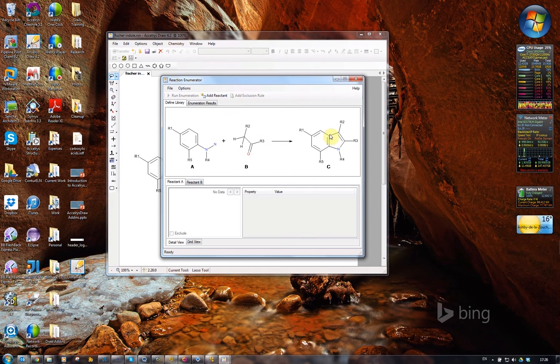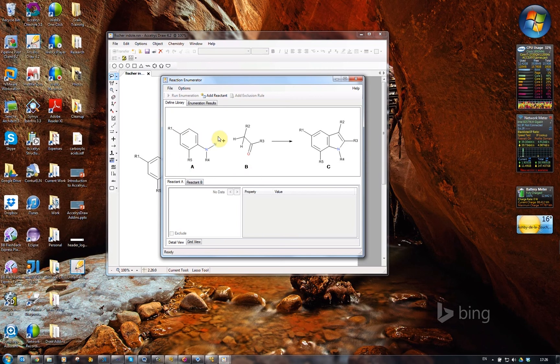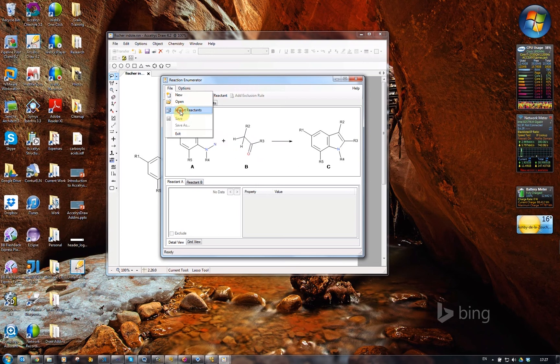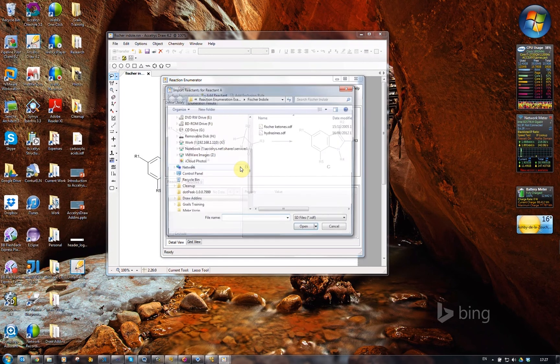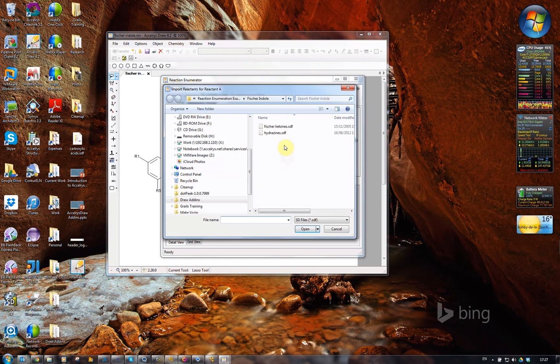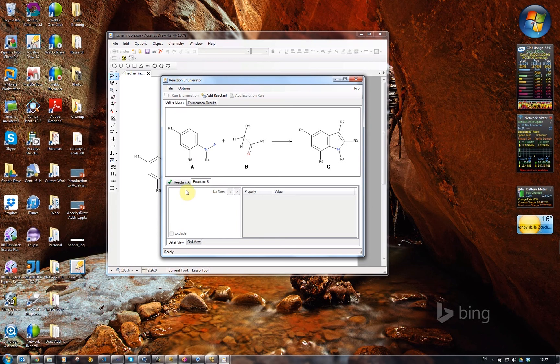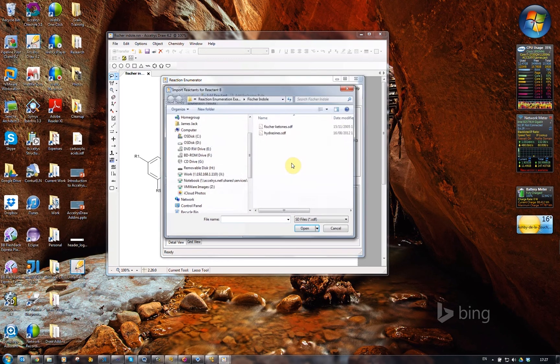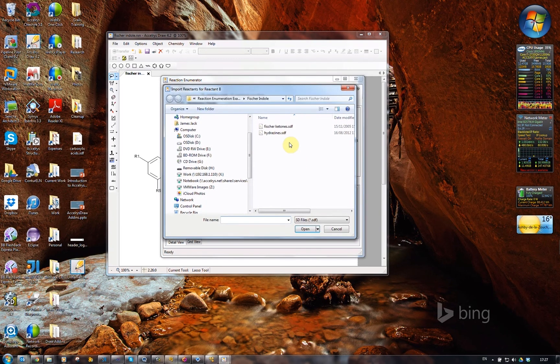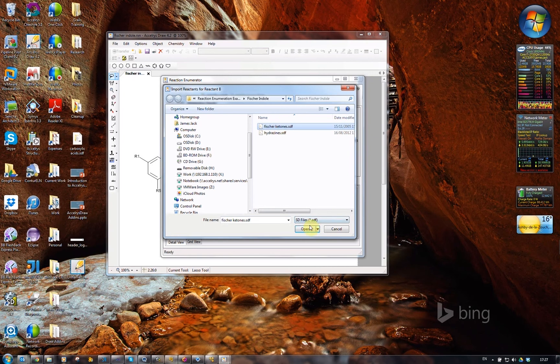I need to load in some data for the hydrazine and the ketone in the form of SD files. I can go and import reactants. There's the hydrazine SDF, and it switches tabs, and I can import the ketones.